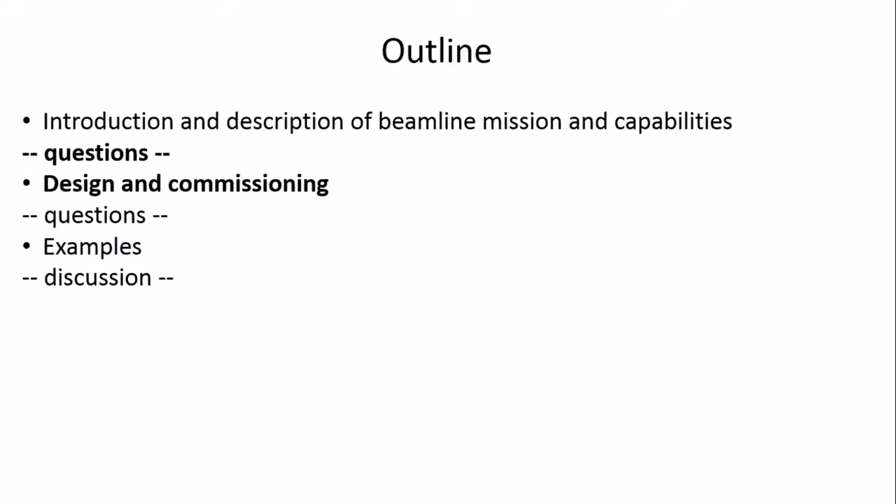Okay. And what kind of in situ electrochemistry can be performed? Like what kind of cell will be suitable to do electrochemistry in situ? Okay, we're testing a variety of microreactors and small cells. The space constraints are that you have about 100 millimeters in every direction to contain your entire sample cell arrangement.